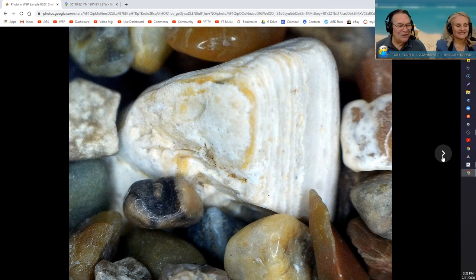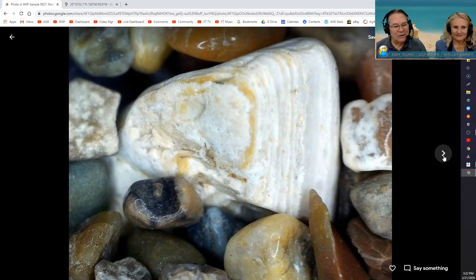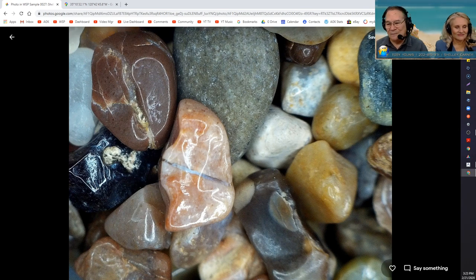So this is the material that's larger than 2 millimeters, doesn't qualify as sand, qualifies as granules. It's larger than 2 millimeters, but smaller than 4 millimeters. And you can see one of those granules just does happen to be a miniature shell. But there were some interesting things. You can see this strip of metallic looking material in this one rock. So I'm sure a geologist who's more experienced than me, but all geologists are more experienced than me, could explain why that's there.